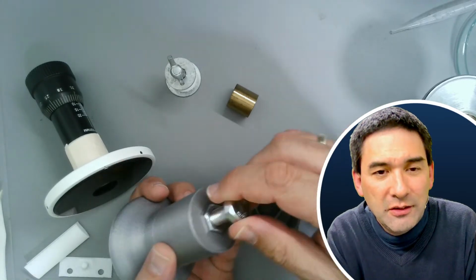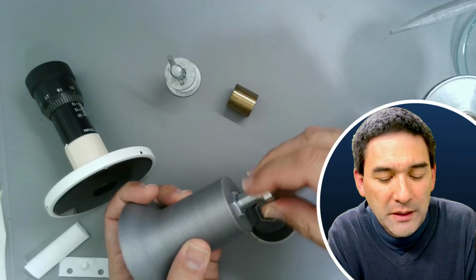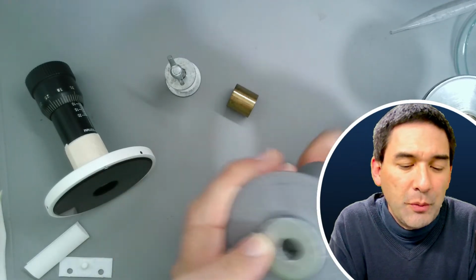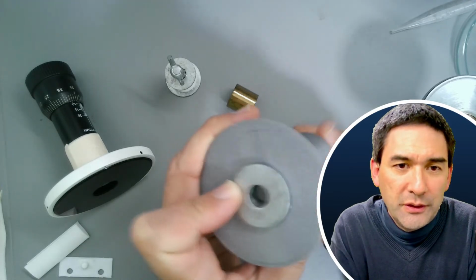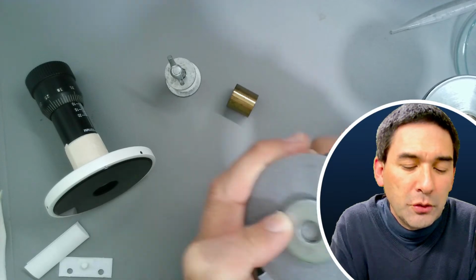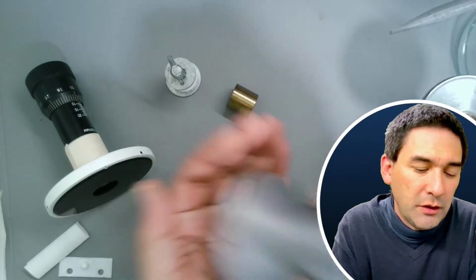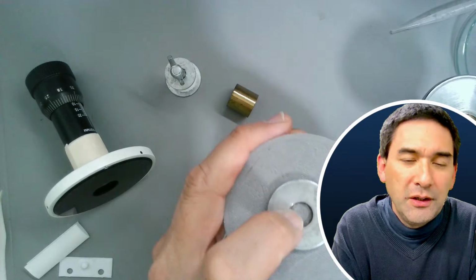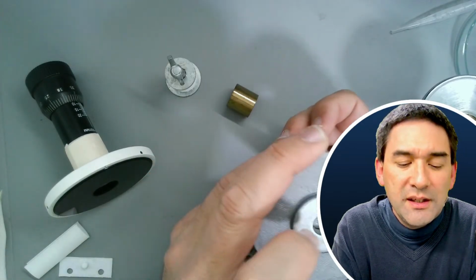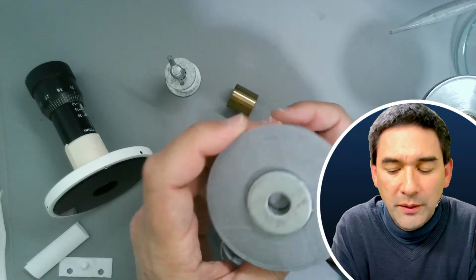And as you can see, there is a screw in here that can be turned. And there is a little piston in here, also 3D printed, that's kind of pushed out. I don't even know if I'm able to get it out completely. It's a little plastic, 3D printed piece. I can't get it out, but you get the idea. So the reason why this is in there is so that it doesn't turn with the screw.